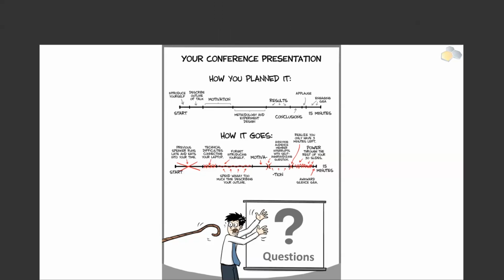To use sophisticated tools like this in regulated applications, can you comment on the kinds of in silico and then also biological samples that might be needed to optimize and qualify a pipeline for a particular use? This is an excellent question. This is a question for most of the tools that we should be creating. Both of the tools have been thoroughly examined with in silico and biological samples, to be honest.